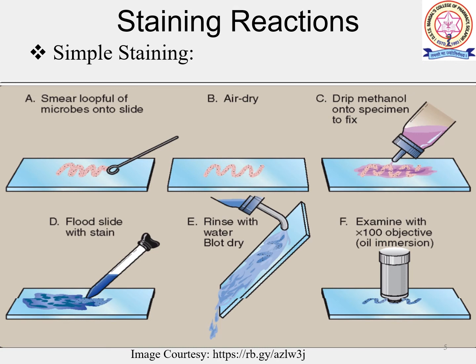This will be useful to differentiate the bacteria from the yeast cells. When an endocervical swab culture is taken on blood agar, staphylococcus species and yeast are both present in the cervical area. So if you have to focus on which type of infection is more prevalent, then this will be useful, because staphylococcus and yeast both show similar colonies when cultured on blood agar.